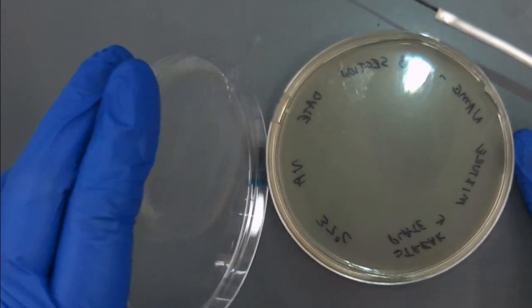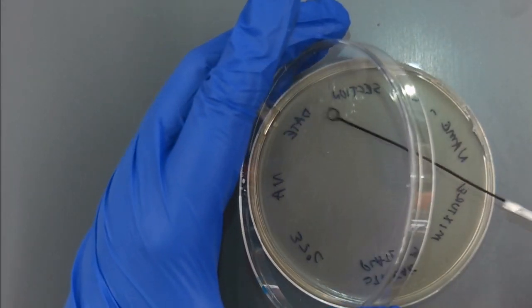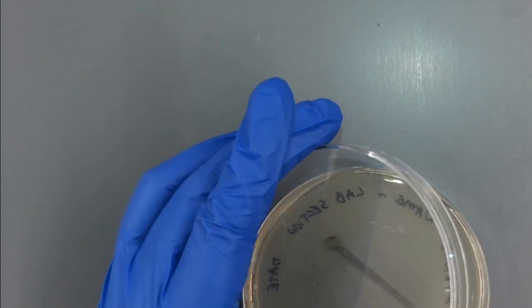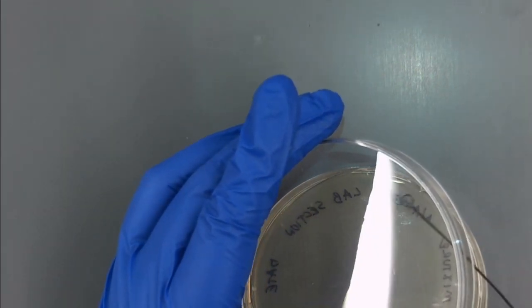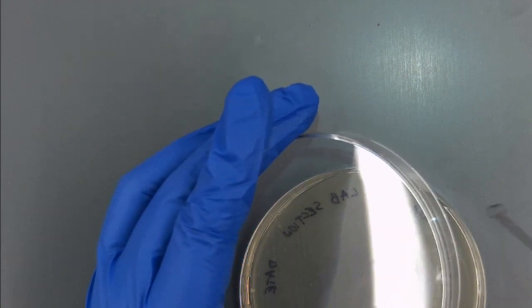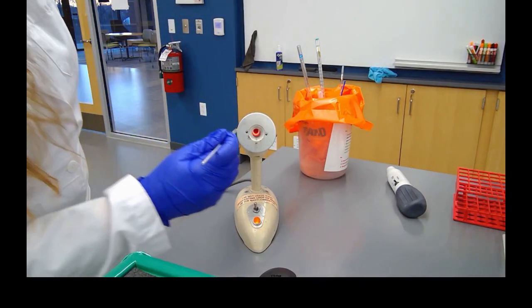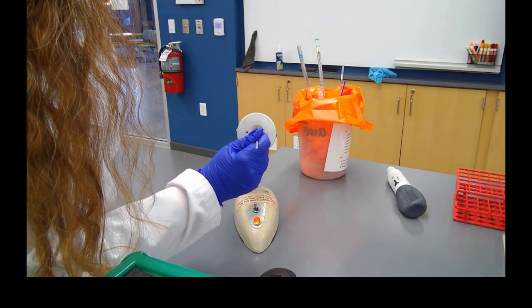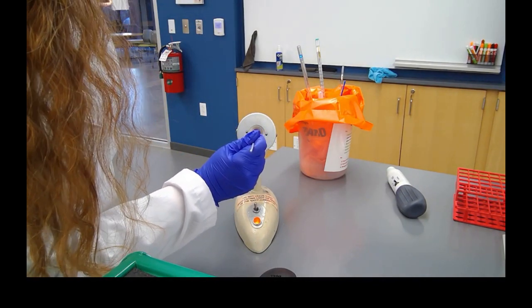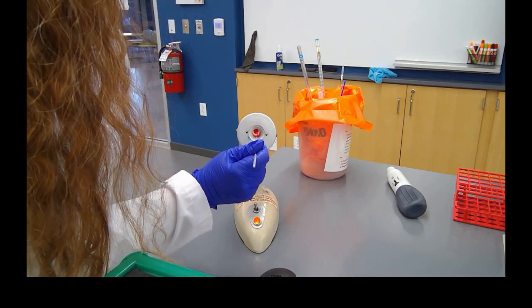What I'm going to do is turn the plate a little bit and use my loop to drag the bacteria that's already on the plate into a new section. So I'm spreading out the bacteria that are already on the plate. And now I'm going to go ahead and flame my loop again. So I'm going to insert it for a couple of seconds until it gets red hot. And I'm going to let it cool a little bit.